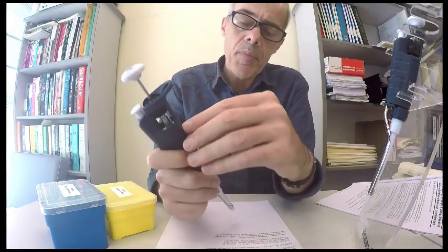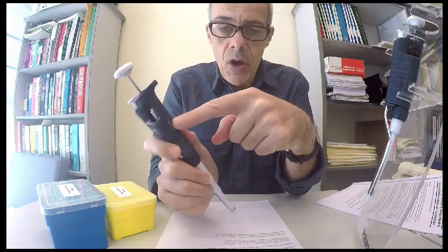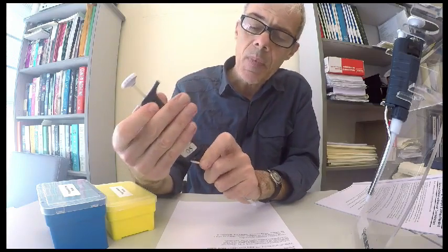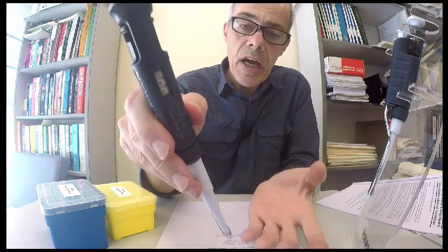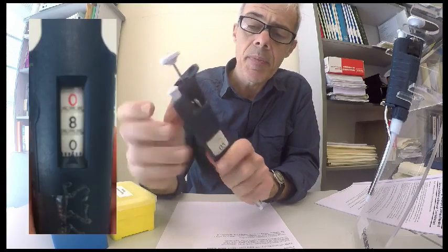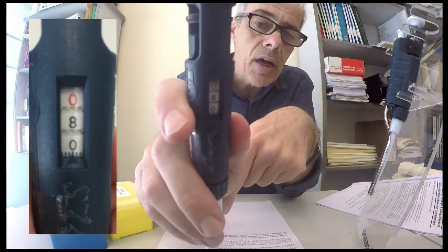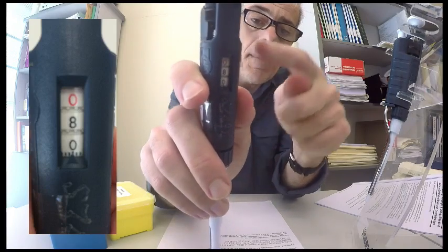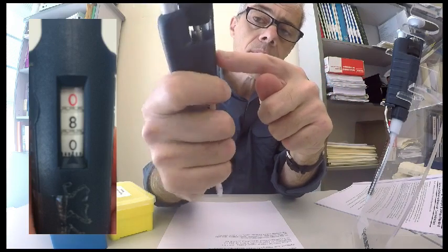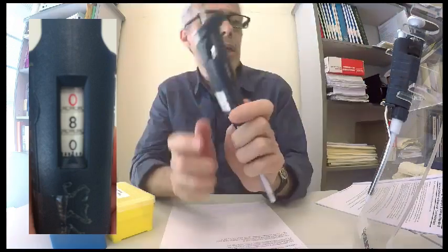The zero for the smaller volume is not shown. So 100 on this scale refers to 1,000 microliters, and therefore 90 on this scale would refer to 900 microliters. And we want to dispense 800 microliters. So the 0.80, if you think of the red digit as expressing milliliters, then the decimal place would be after the red digit, and it would be 0.8 of a mil or 800 microliters.